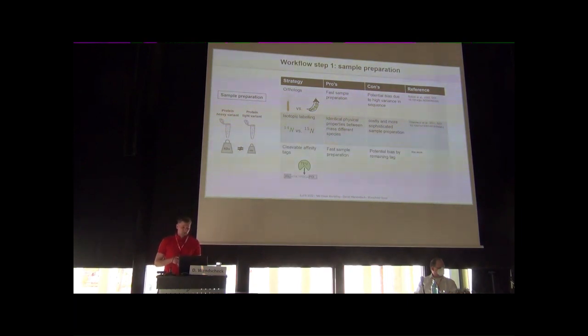The strategy that I'm using is a cleavable affinity tag. The protein that I'm investigating is recombinantly expressed and purified, and I'm using a TEV cleavage site just to cleave off the tag, and by this I have a portion with the tag and the other without, and then I have two mass different species.